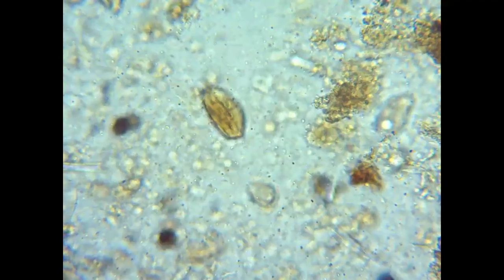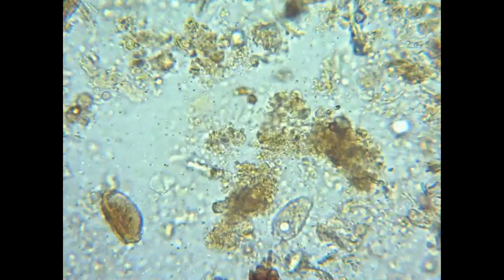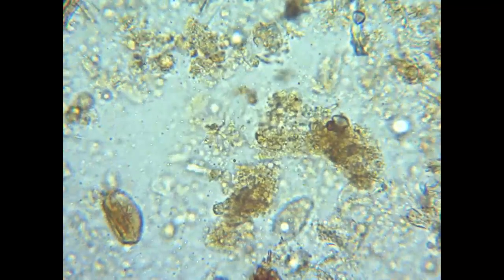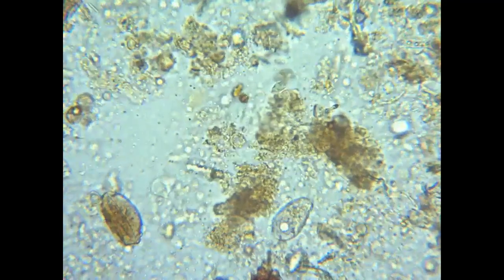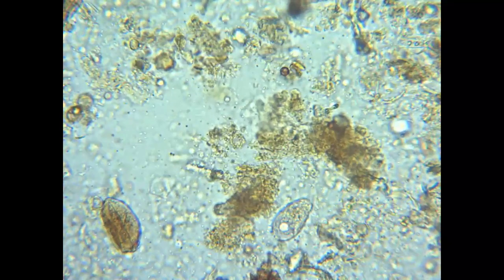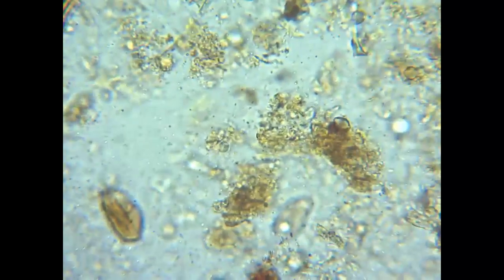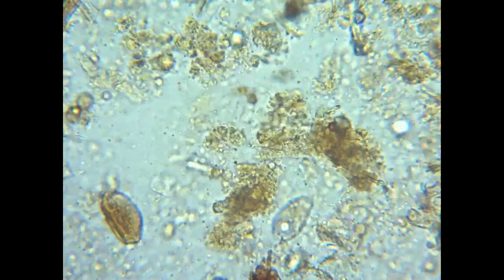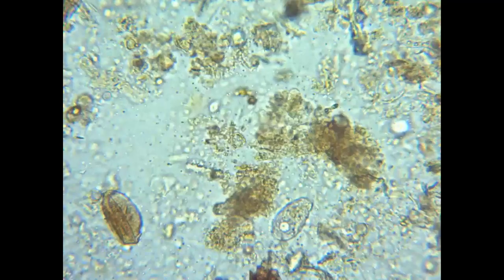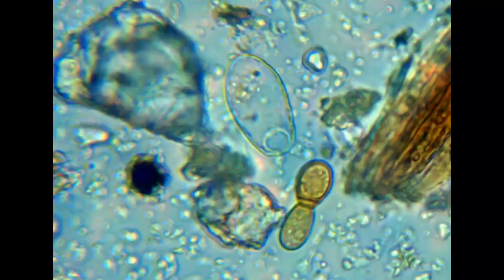Then there are ciliates, sometimes called race car drivers — they can move really fast. If you look through the microscope and suddenly see something zoom across before you can even see what it was, that's most likely a ciliate. They move smoothly and are covered with a whole bunch of hairs called cilia that help them move. The amoebas and flagellates are usually a sign of good soil, whereas ciliates are a sign of anaerobic conditions. You can have one or two ciliates on a slide and that's not too bad, but when you start seeing a whole bunch of them, you've got a problem with your soil.